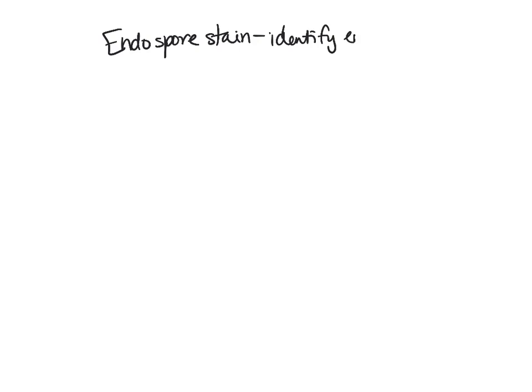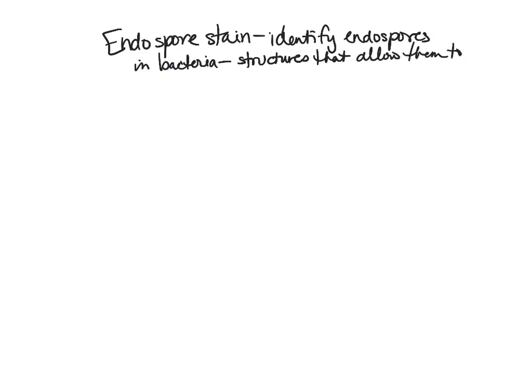All right, so the next stain is our endospore stain. Our endospore stain is going to allow us to identify endospores in bacteria. And endospores are structures that allow them to survive in harsh conditions.